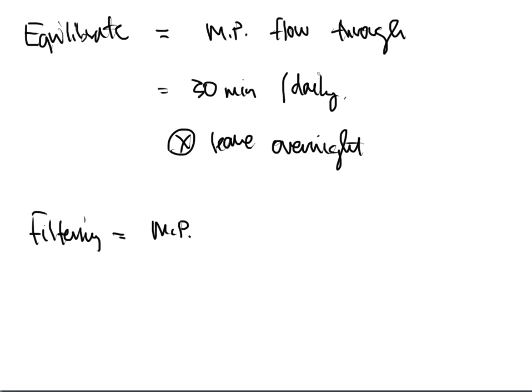We just don't take that step. We're kind of lazy when it comes to that. The filtering aspect of the mobile phases, you want to send through a 0.45 membrane filter. These membrane filters you've probably used before. These are the typical small syringe filters that go onto the end of those syringes, and you can push your sample through them, and you've probably prepped small amounts of samples before in that way.